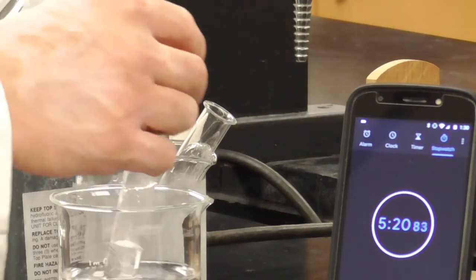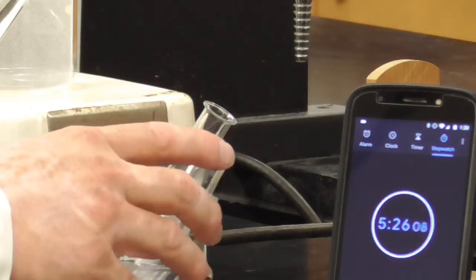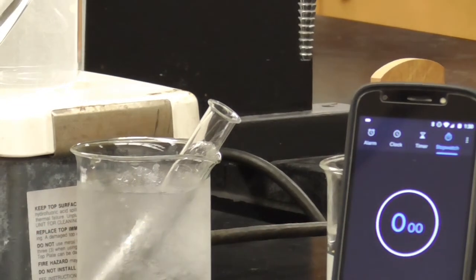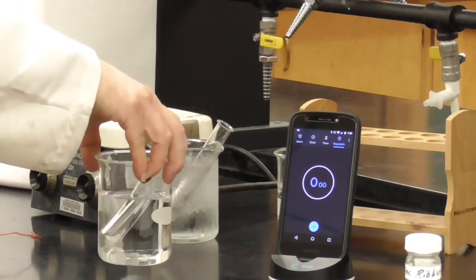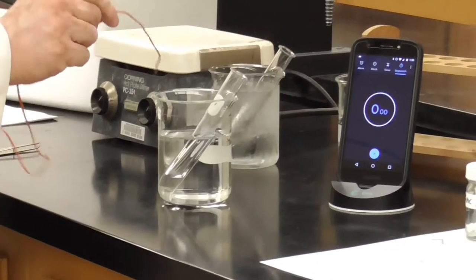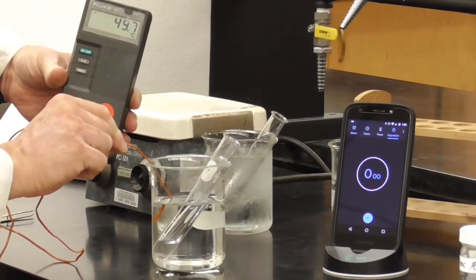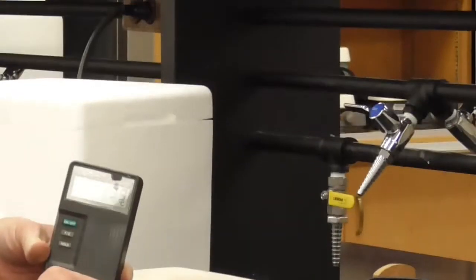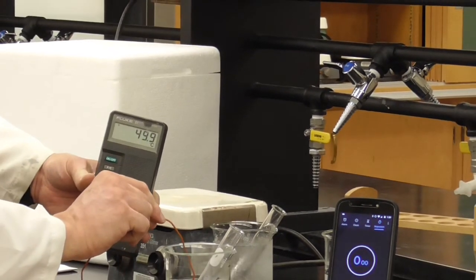All right, so you saw the time. That was at room temperature. Push that one aside. Now we'll set my stopwatch. Now let's go ahead and do the one that's been heating on our hot plate and move that one into position. Excuse me. Let's go ahead and see what the temperature of this is. Hey, that's pretty good. We're trying to get 50 and we got 49.7. Not bad. Not bad at all. 49.9. So we're right there, just about 50, just about where we were supposed to be.